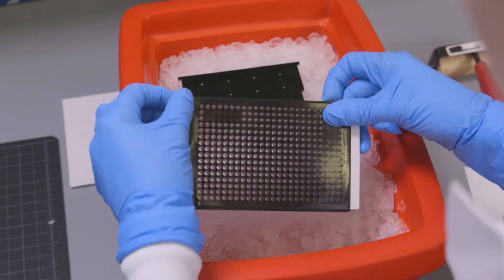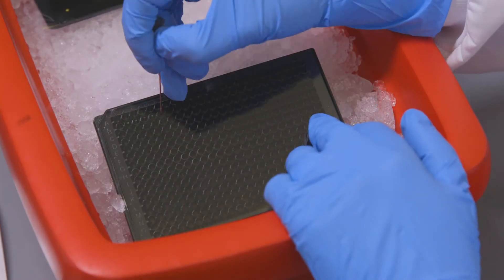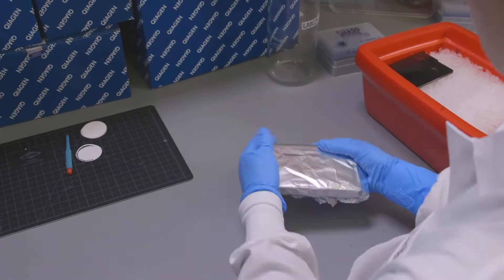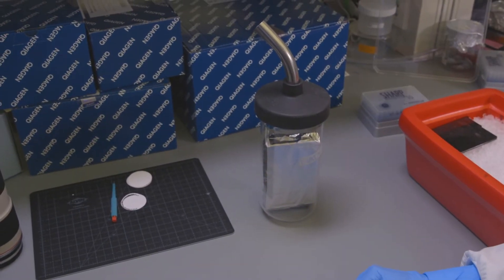We then seal the plate and punch small holes at the top of every well to prepare the samples for freeze-drying. The plate is flash-frozen and placed onto a lyophilizer overnight.